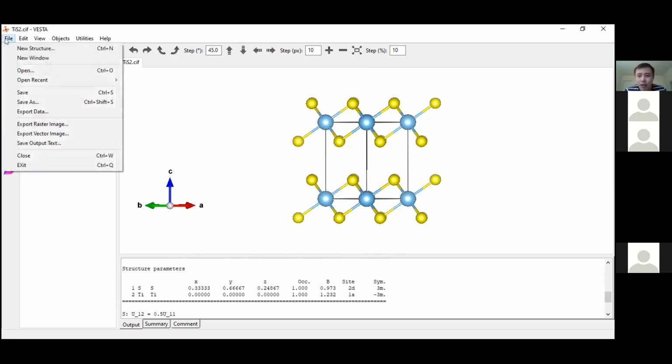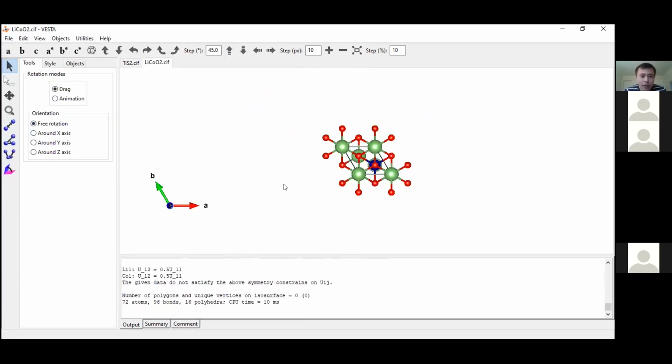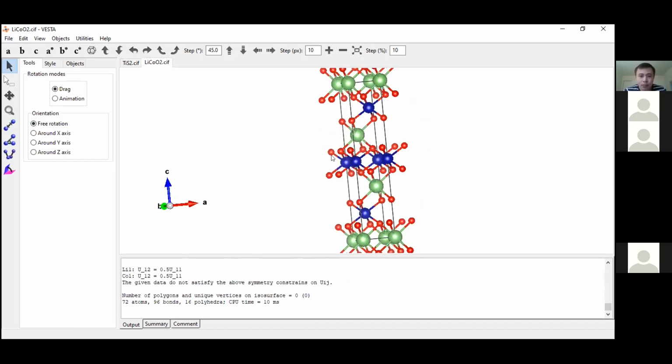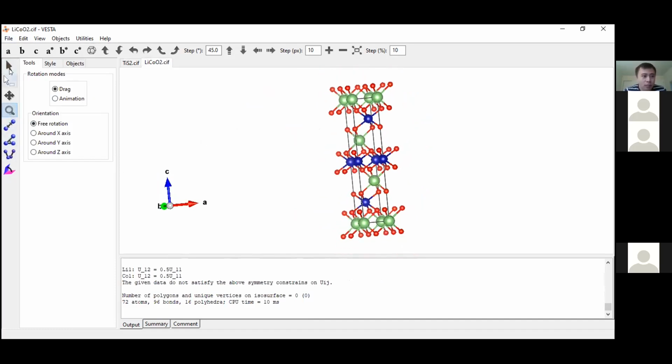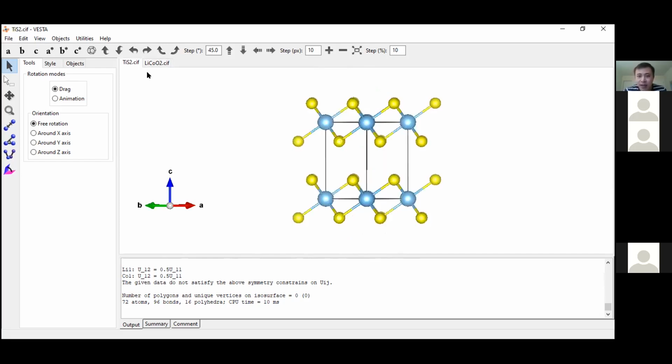But if you look at the lithium cobalt oxide, let's check here. If you look at the lithium cobalt oxide, you see it's not HCP. You see this is, let's say this is A, you have B, you do not have A here. A should be here, but it's not A here, it's actually C. So it's actually ABC, which is a CCP stacking, which means when it's lithiated, actually you will have the CCP stacking. And if it's delithiated, it will actually have HCP stacking.